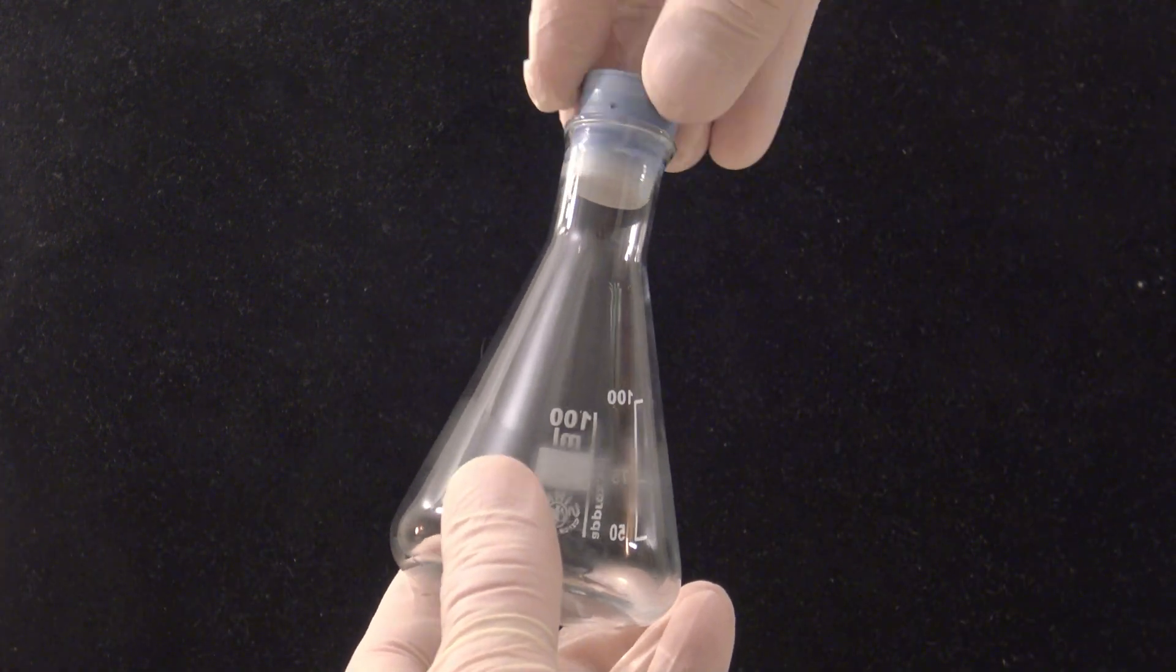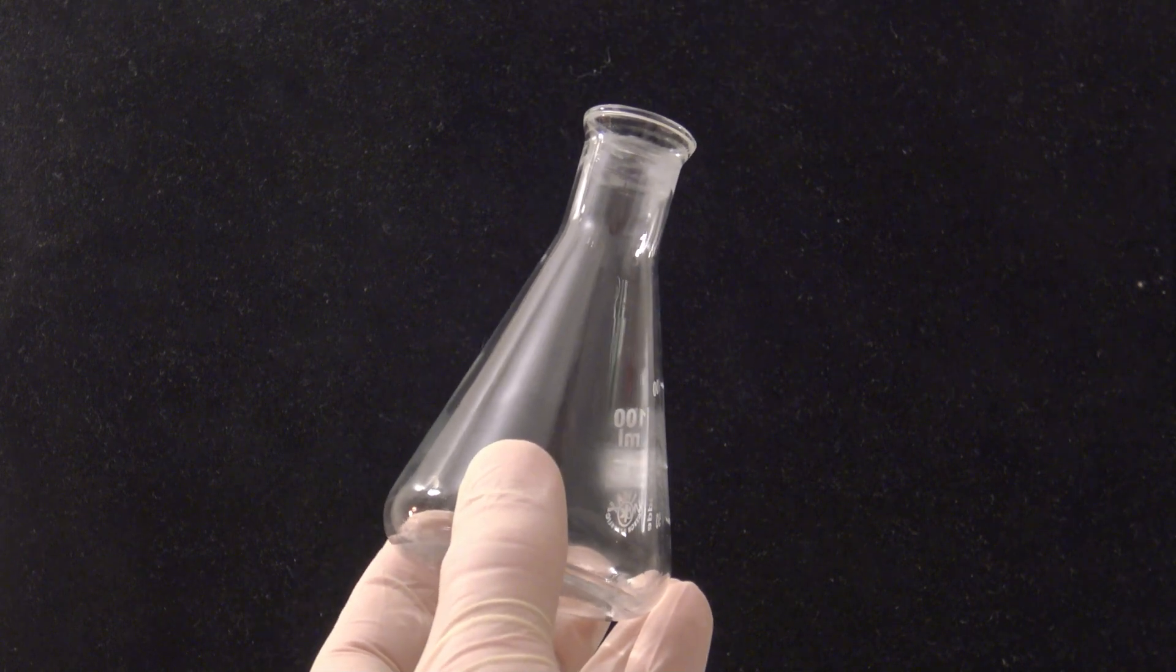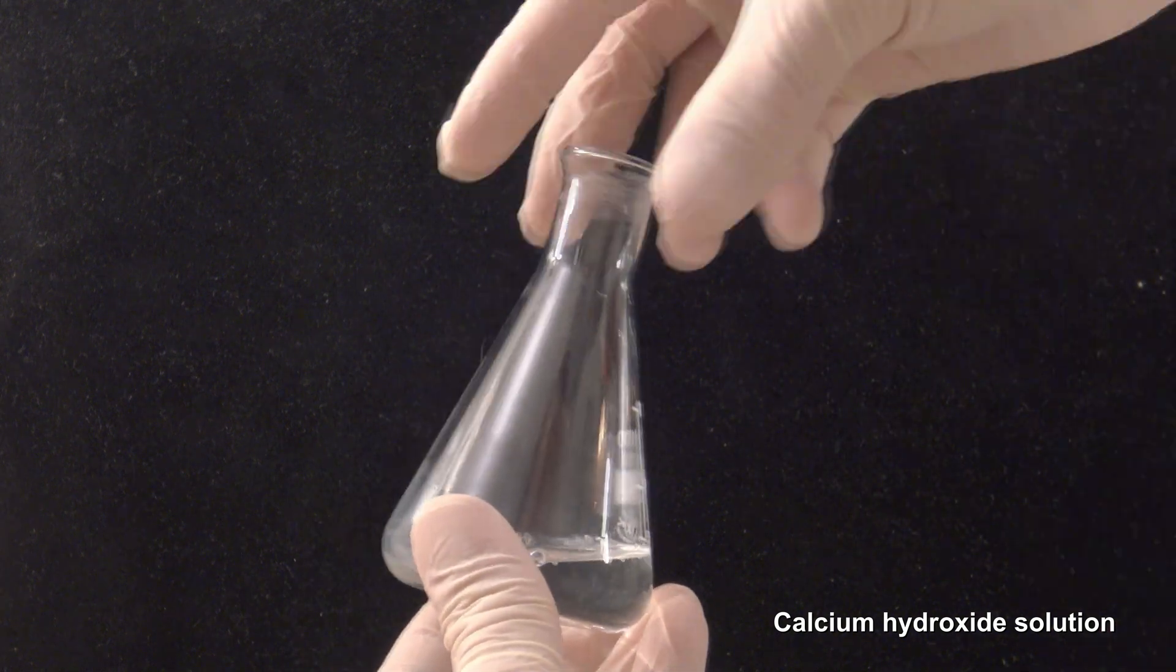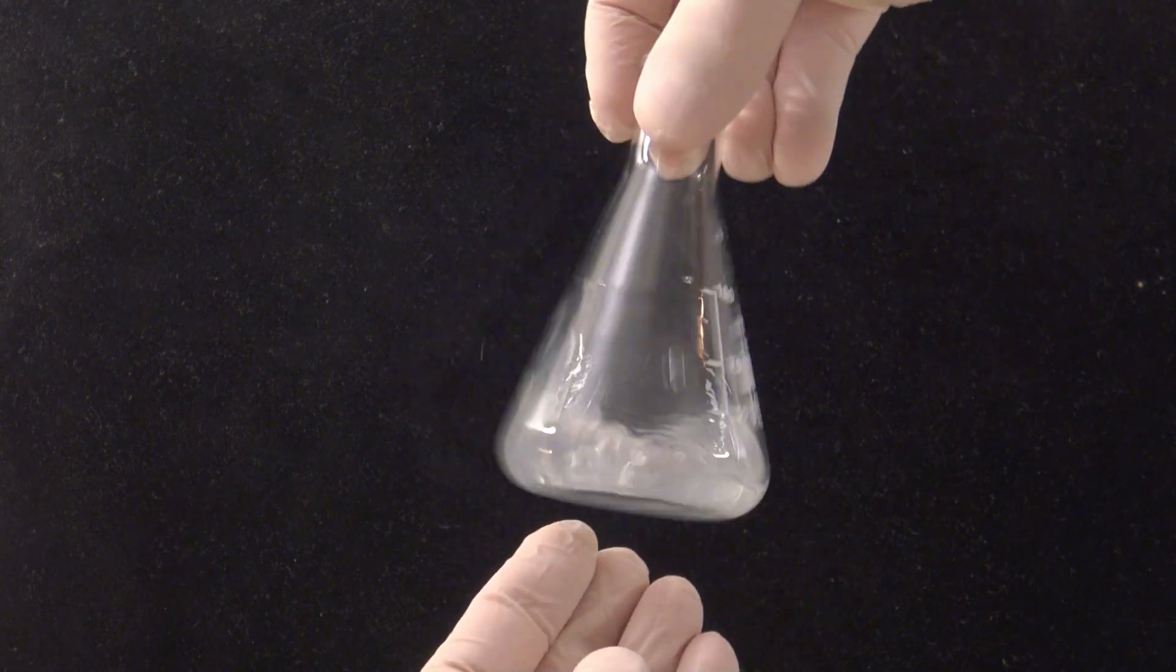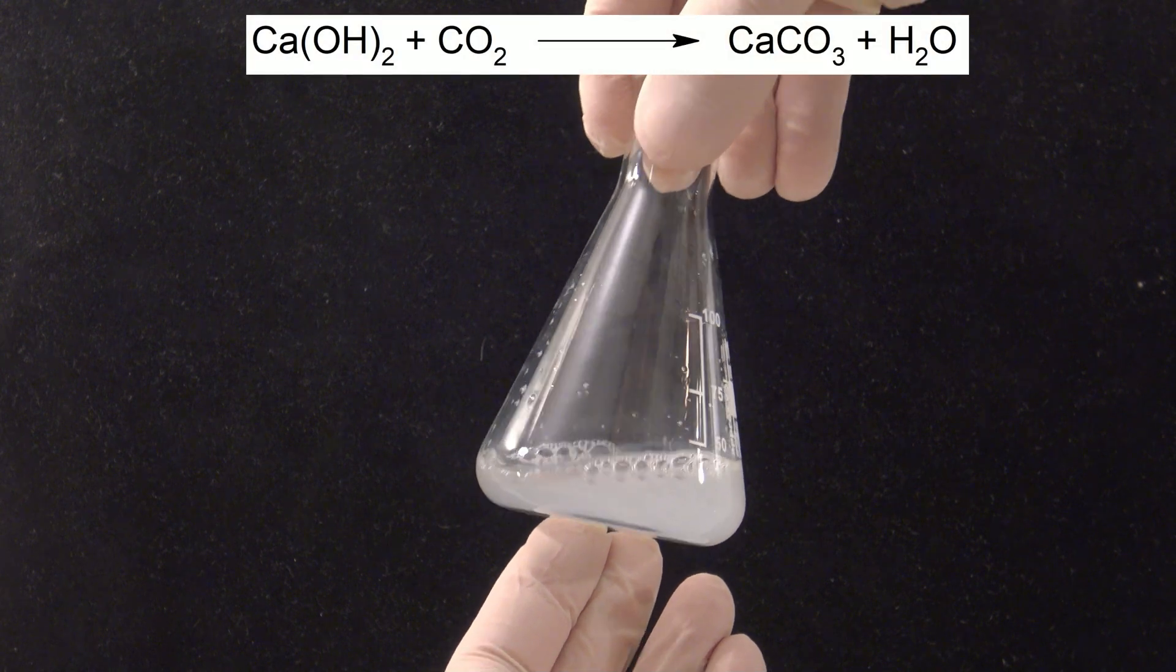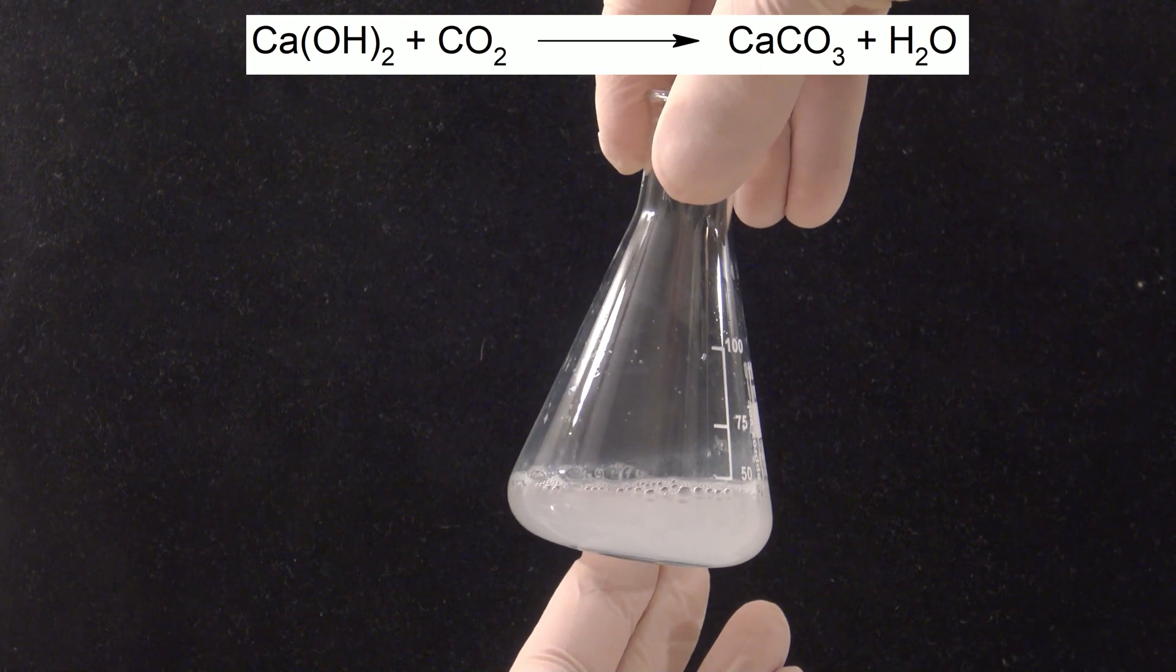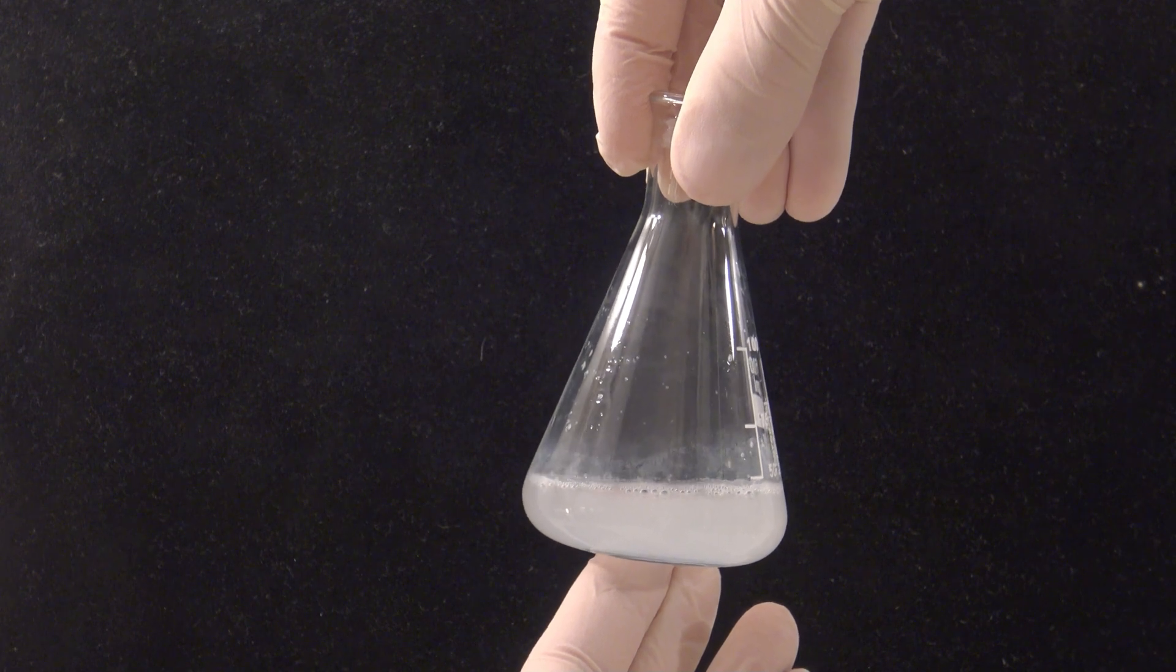The second product of the combustion can be detected by adding a calcium hydroxide solution. When the flask is shaken, the solution becomes cloudy. The second compound is carbon dioxide, which reacts with the calcium hydroxide to form insoluble calcium carbonate and water. This leads to a cloudy solution.